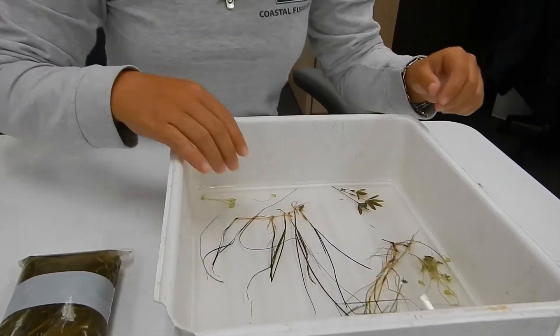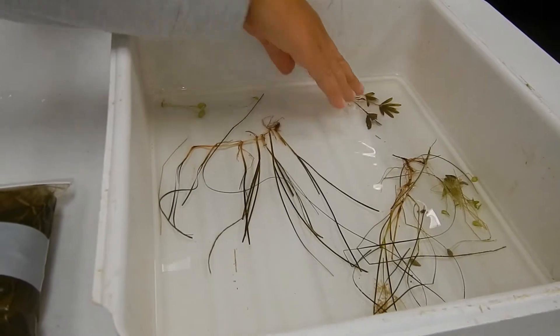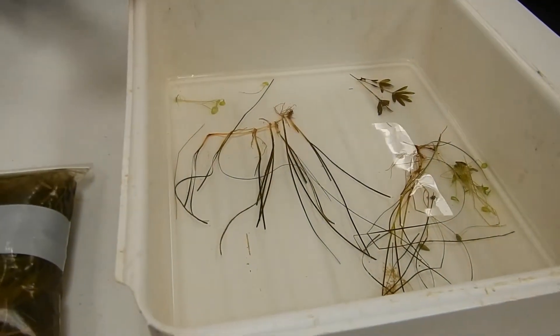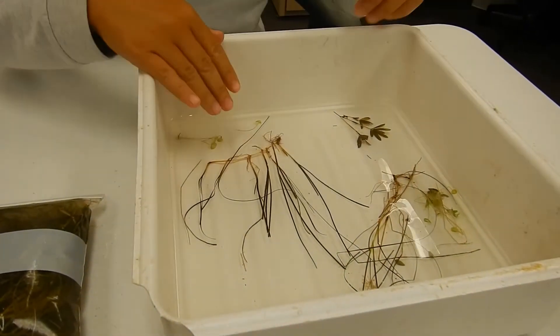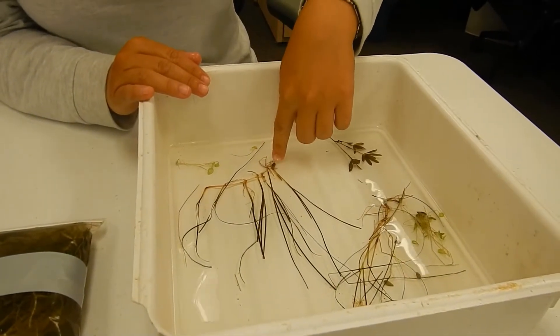First we separated them out by different species. This is the star grass, the shoal grass, and mermaids wine cup. I'm going to pick this one to press because it has all three parts: the leaves, the rhizomes, and the roots.